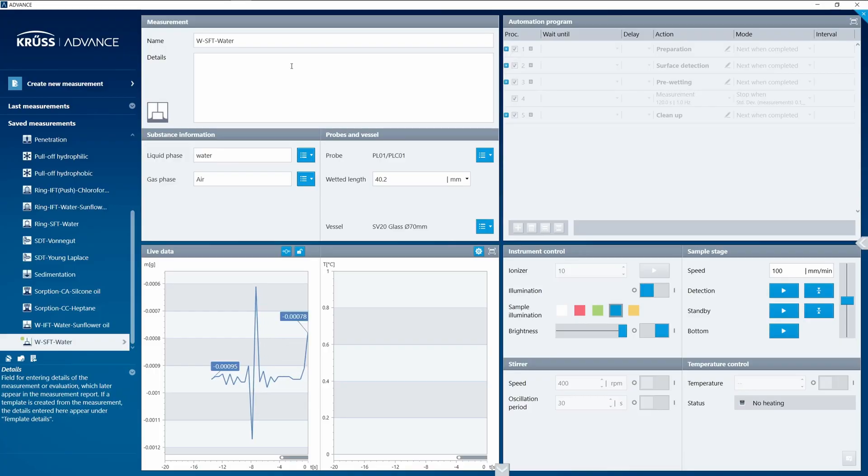Now when you open a measurement up, Advance guides you through the logical progression of an experiment. You start at the top left with giving some details about the instrument and the measurement itself, maybe the sample you're measuring.